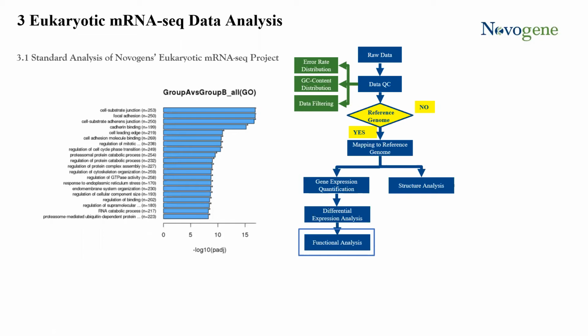This tool is particularly interesting when trying to analyze new drugs and where their function lies. For example, by comparing a control group with a treated group, we can statistically analyze which biological pathways are changed and focus our studies on further characterizing them.